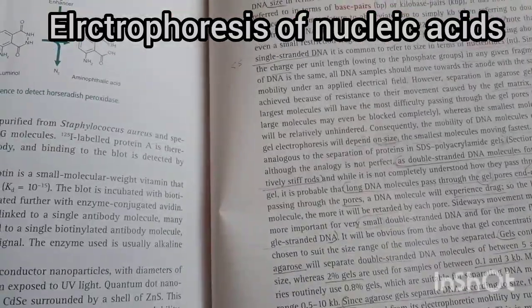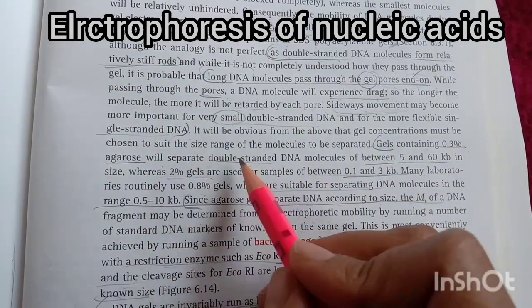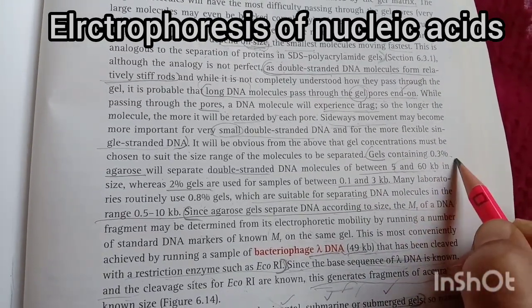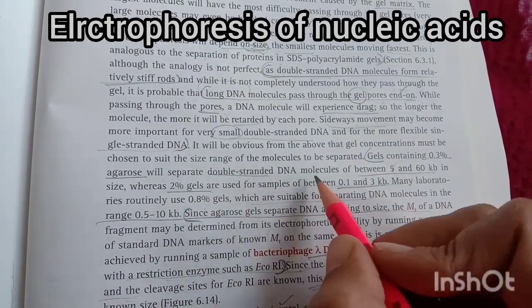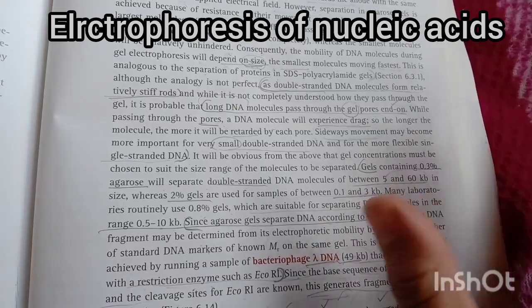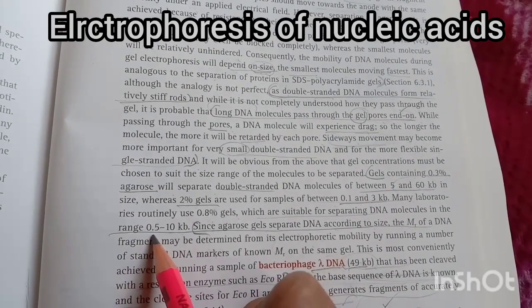Now if we talk about the gel amount, a gel containing about 0.3% agarose will separate double-stranded DNA molecules between 5 to 60 kb. As the gel percentage decreases, the kb range increases. If we increase the gel to 2% agarose, the samples can be separated between 0.1 and 3 kb. But mostly, the optimum 0.8% gel is suitable for separating DNA molecules between 0.5 to 10 kb.